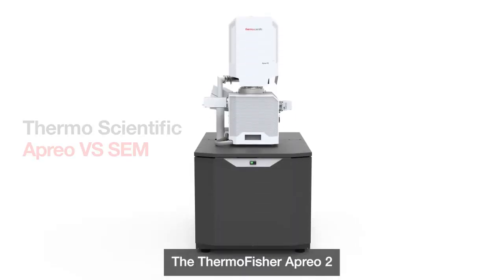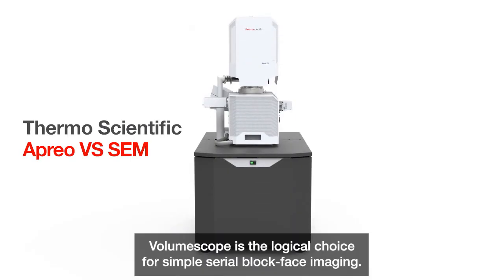The Thermo Fisher Aprio II Volume Scope is the logical choice for simple Serial Block-Face Imaging.